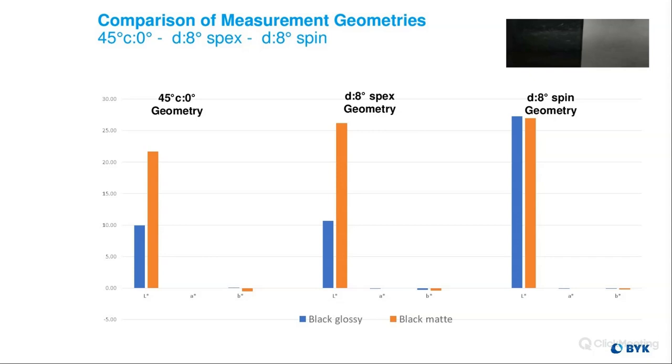When you put it on top of the sample, just the gravity of holding it there is going to block out the other light. So only the measurement area in the port is measured, and there are no outside lights that will affect it. Great. Good answer.